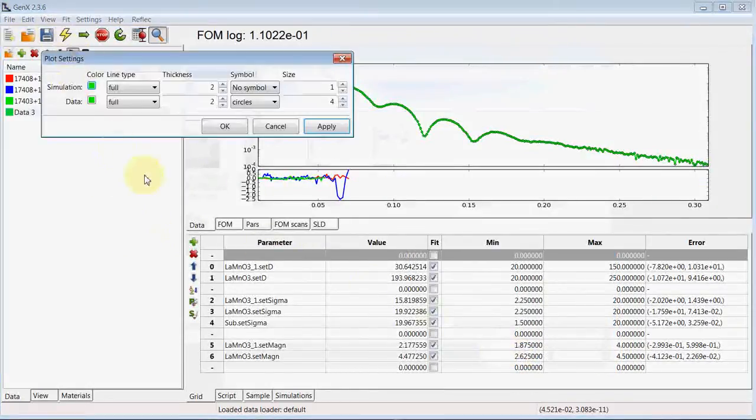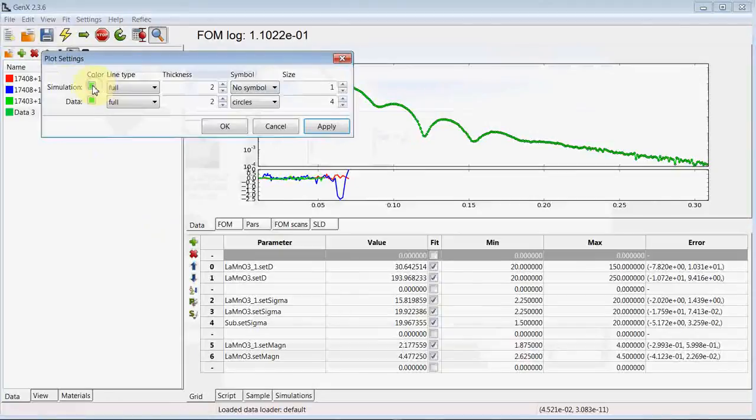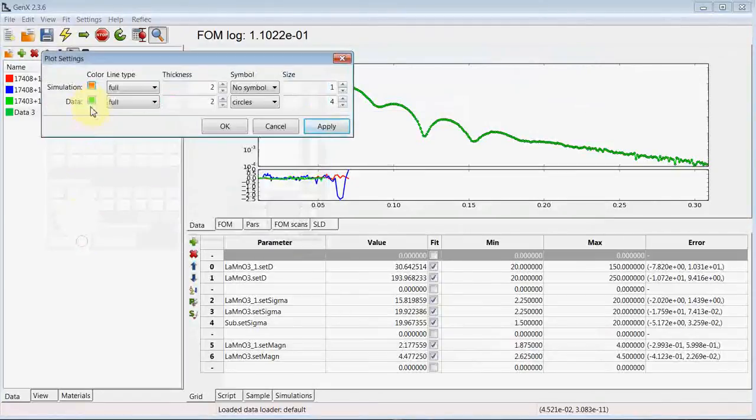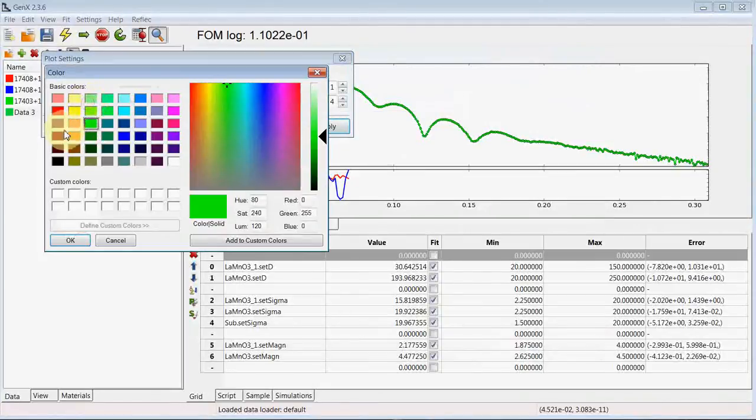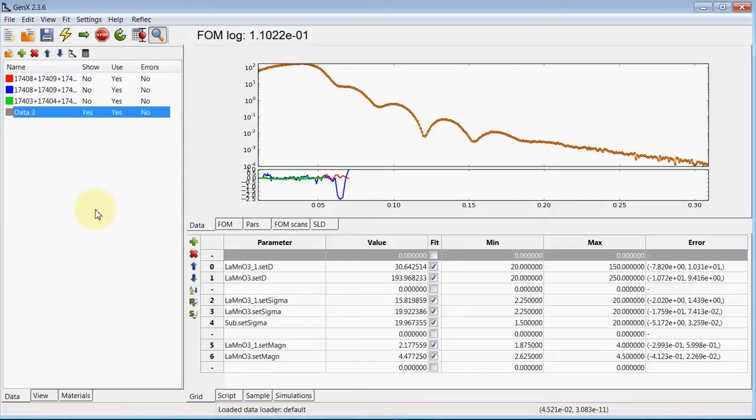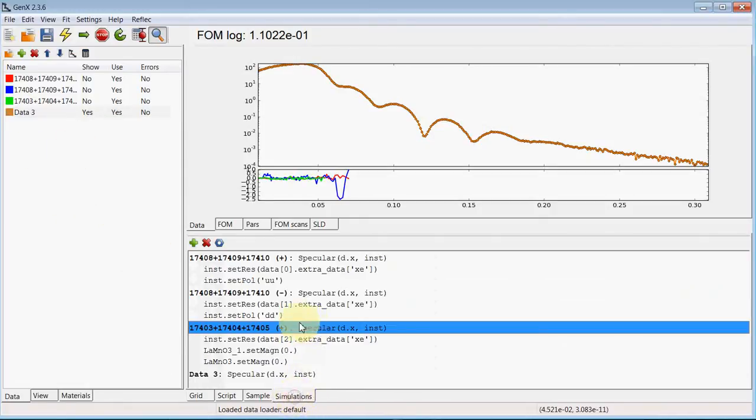Changing the colors again so we don't mix it up with the neutron data sets, and now we want to define the X-ray instrument just for this last data set. We go to simulations again.